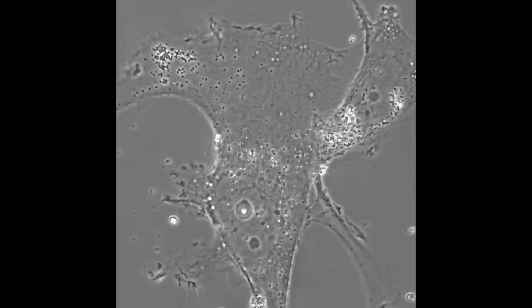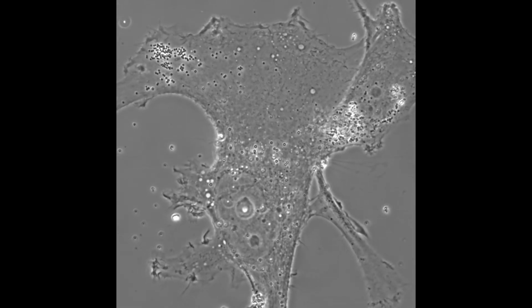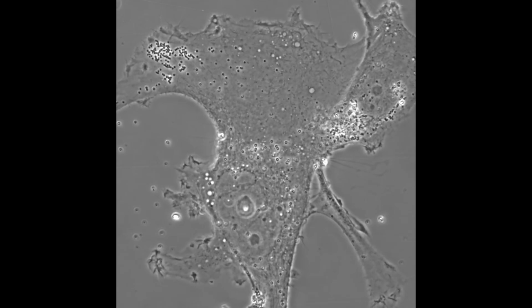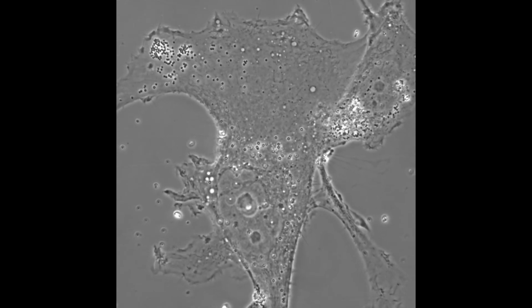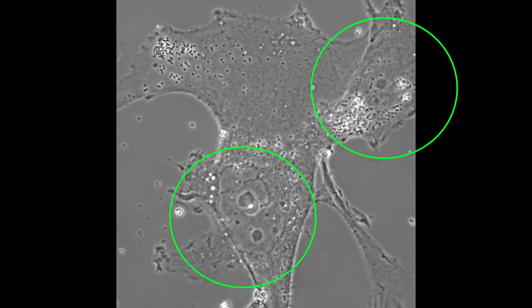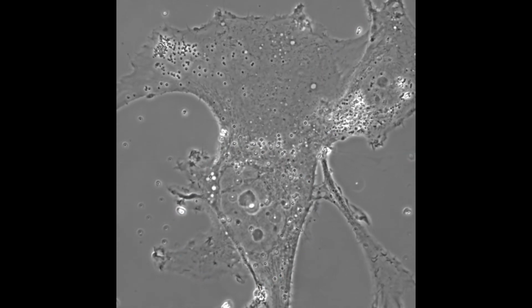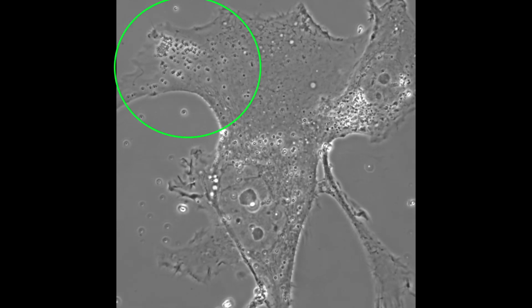Okay, let's zoom in a little. Here, at an astonishing 1000x magnification, yes, 10 times bigger, we dive deep into the intricate life of a single human cell. You can see the nucleus, the command center of the cell, surrounded by a dynamic network of extensions and countless vesicles moving tirelessly within.